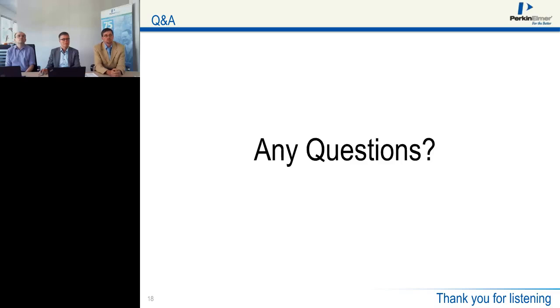Okay, thank you very much. And now the next question is for you, Phil. Do you have any experience in monitoring of ATP release from living cells that are treated but still inactive? Yeah, I think that's a very good question. I think that's part of our next program of work. We want to pull in compound sets which are, let's say, cytostatic compounds, which will allow us to do that and then do detailed kinetic reads. I think that could be quite an interesting research project, and hopefully we'll be able to do that, and we'll try and publish those results as soon as possible.